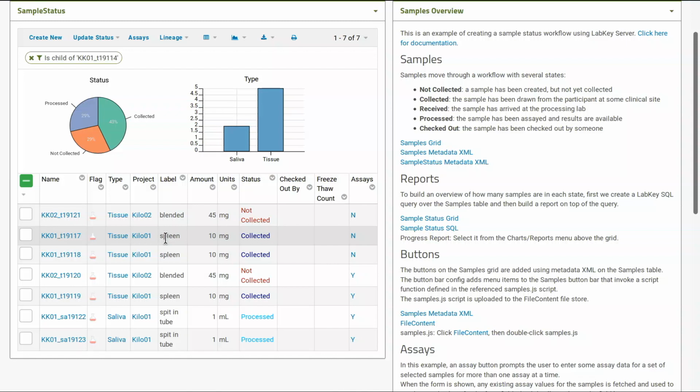I think the only caveat is that it shows me all of the children. It's not looking at the depth necessarily. So we could maybe change it in the future to say I'm only interested in the immediate children or the immediate parents rather than the entire lineage. That's it for my demo. Any questions about that so far?